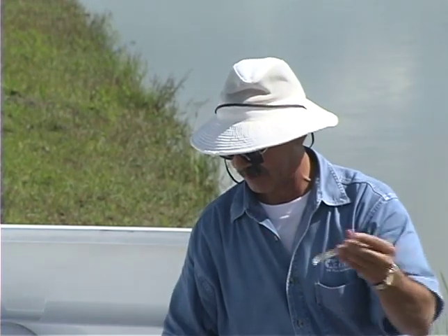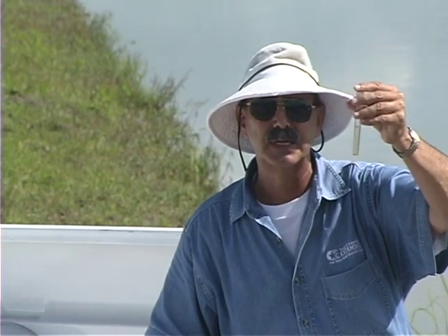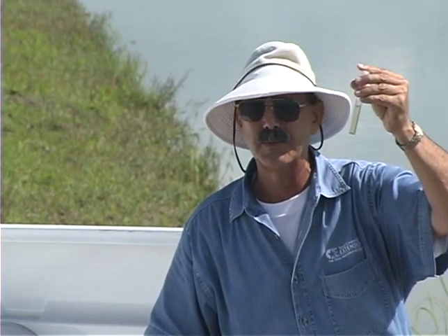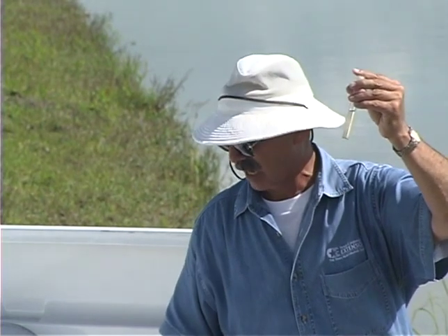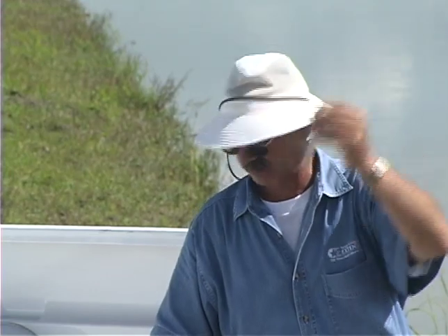We'll cap it and mix it. As you see, we still have a yellow color on the sample, but it's not as dark as it was, so we should be able to measure this on our OctaSlide. It should stay within the range of that scale.